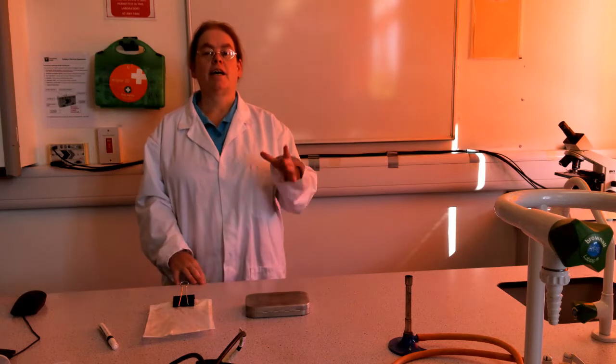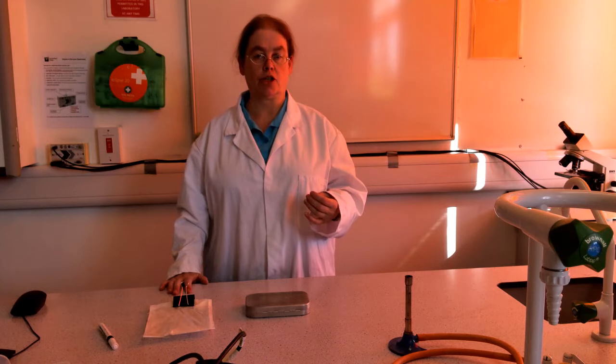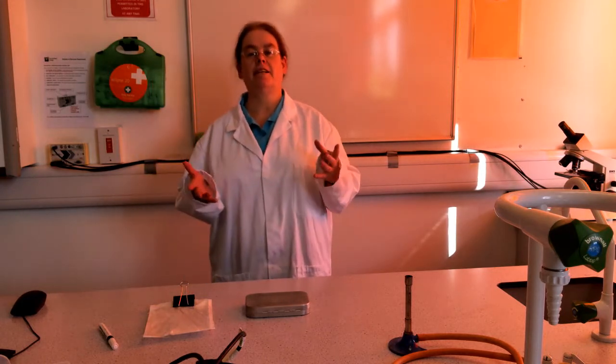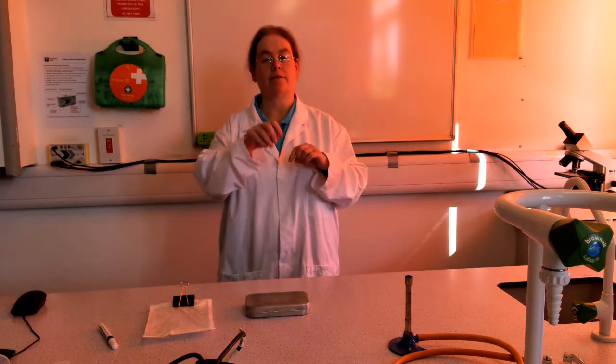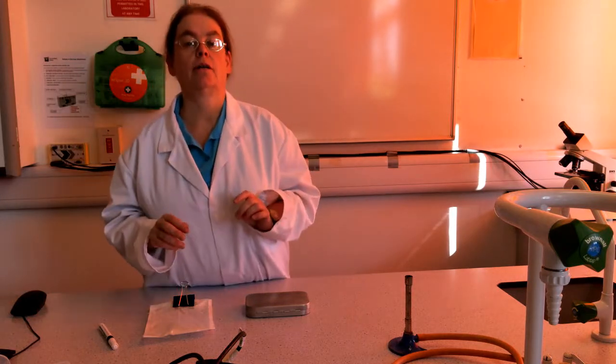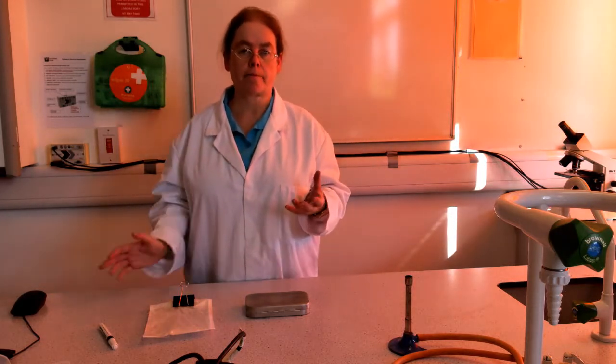So the topic for this video is how do we know how many bacteria there are in a culture? Obviously it's very difficult and conceptually meaningless to talk about how many bacteria there are on the surface of a plate and count individual colonies, but when you have a liquid culture, obviously there are going to be on average a certain number of bacteria per milliliter.